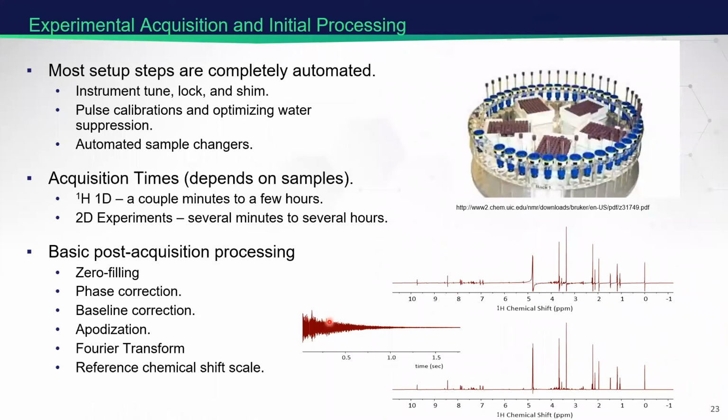So when it comes to setups, I've listed some things that we need to do to get things going. With the modern hardware, modern software today, routines to automate these steps are very, very robust. So a lot of times it's a matter of just entering your metadata, deciding which experiments you want to run, and hitting go. Since I did mention that D2O earlier, that's for the lock.